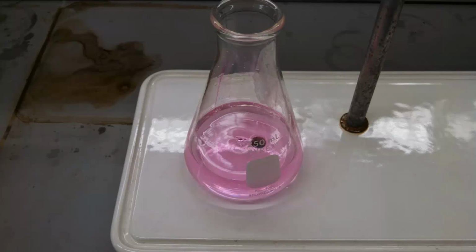So as you go on, you're going to eventually reach a point where the pink color doesn't go away anymore with swirling. This is sort of the darkest endpoint that would be acceptable. The lightest endpoint that would be acceptable is where you can just barely see a hint of pink. As long as the pink sticks around for 30 seconds or so, you know that you're at the endpoint.